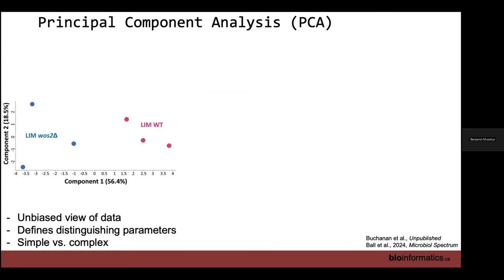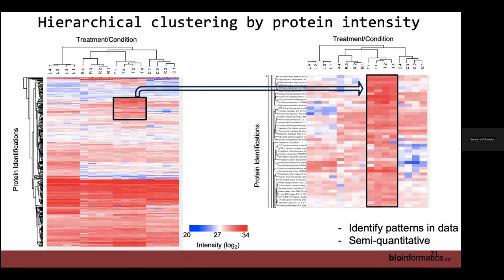Yes. Is that okay to do the... To do what, sorry? Is that sort? Yes, yeah, absolutely. So these ones are the log two intensity. We also do some on Z score as well, especially if you want to subtract like a background or a baseline, then by all means, as long as you're transparent in how you represent it, you can plot however you like. Yes, absolutely. So it really is about what story you want to convey with your data.